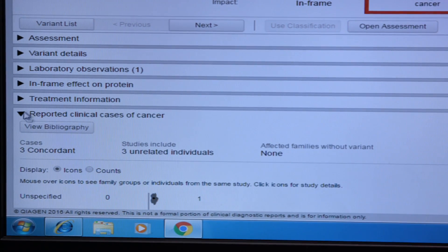But how difficult is it to get the platform up and running? To get it up and running is very simple. You can take a VCF and run through our manual upload and it would start working right away. We also have options if you want to do some additional automation in your lab, where we can customize the tool and really streamline the process.